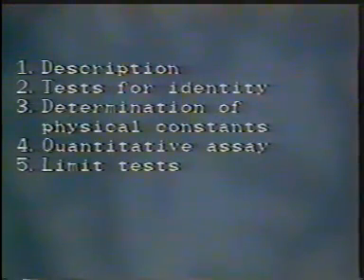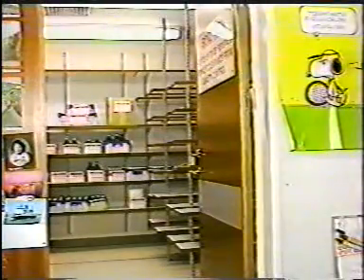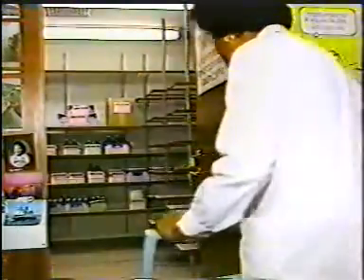Having set the standards, it is necessary to ensure that all raw materials are in fact tested and approved by quality control before they are used in manufacture. Raw materials are therefore placed in a special bond store on arrival to await sampling and testing.